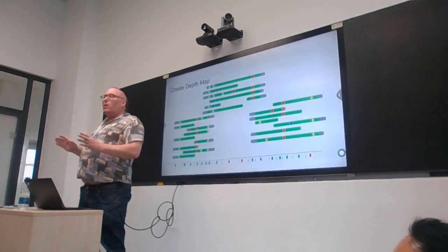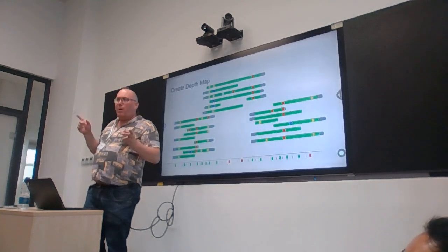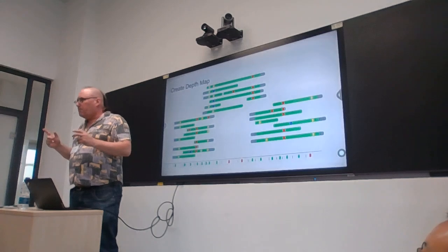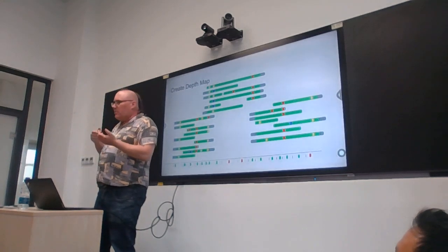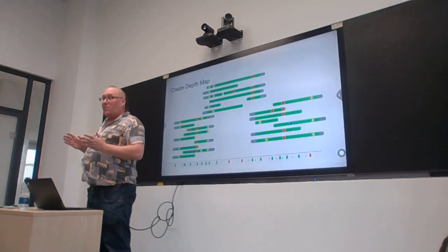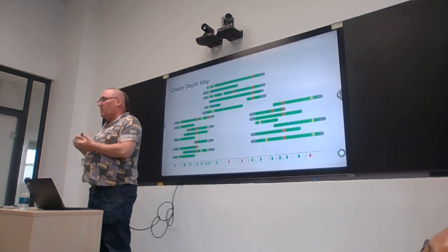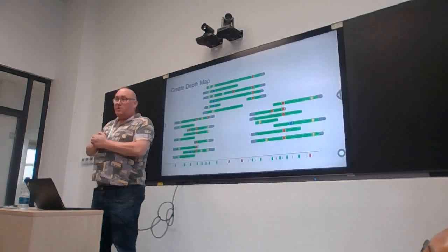So we get a lot less than 100% per Mpox virus genome. In my experiments, if we get 85%, it's actually not bad for Mpox. Whereas 85% was not nice for COVID-19, now 85% is actually quite good.